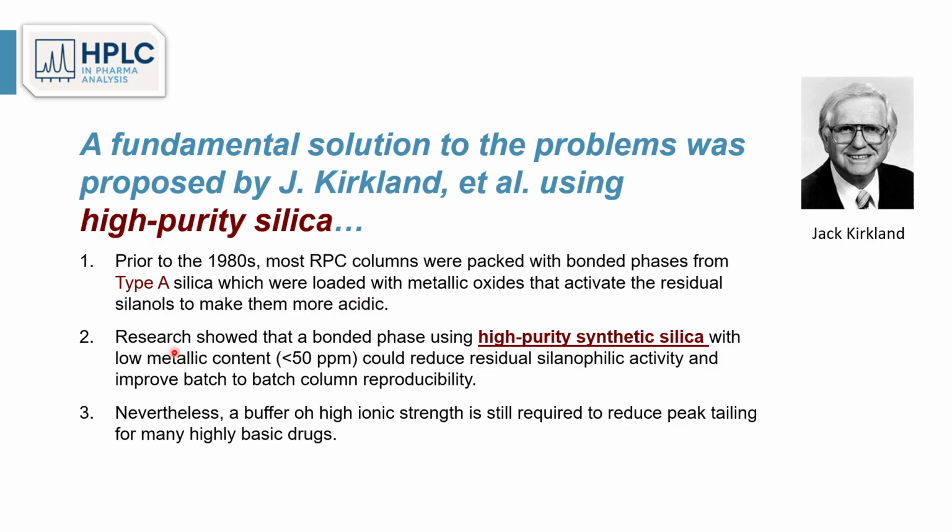Research conducted by Jack Kirkland and co-workers showed that bonded phase derived from high purity synthetic silica with very low metallic content, typically less than 50 ppm, could reduce residual silanophilic activity and also improve batch-to-batch column reproducibility. Nevertheless, a buffer of high ionic strength is still required for those drugs or basic analytes which are very highly basic, such as those containing more than perhaps 2 amino groups, 2 ionizable nitrogen groups.